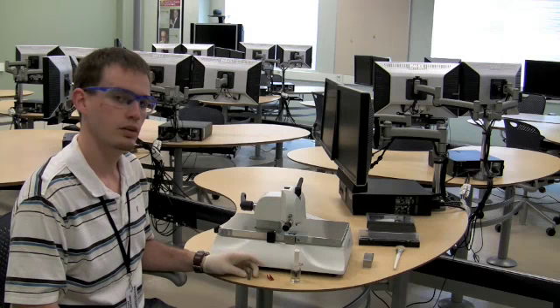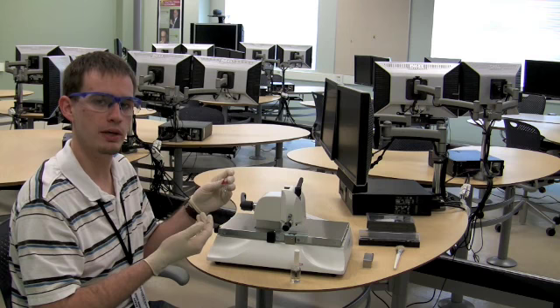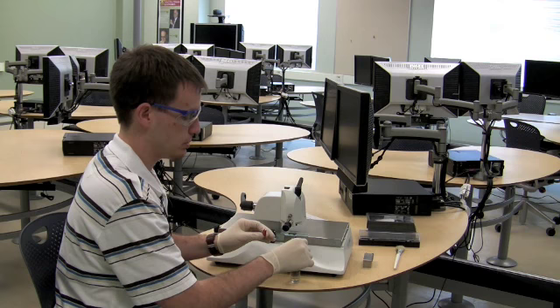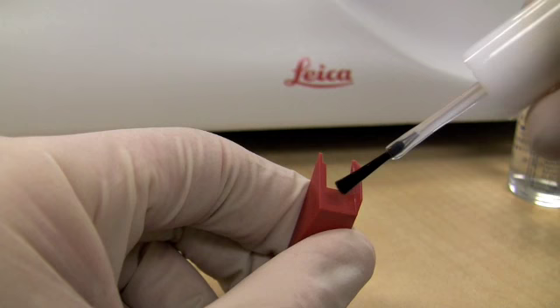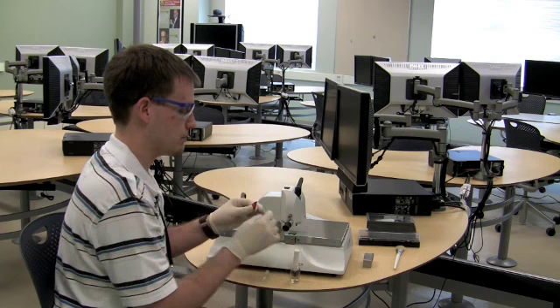Once we've determined which side is the cutting edge of this knife, we're going to need to attach a trough to the cutting edge. This is going to be used to collect the sections as they come off the microtome. So what we do is we take our trough and on the back of it, we apply a little bit of nail polish. Now the nail polish is used because it's going to quickly dry and allow it to bind to the glass.